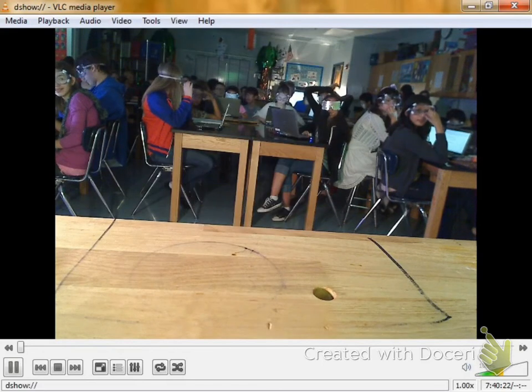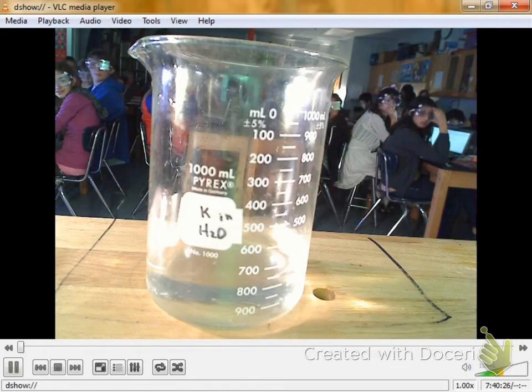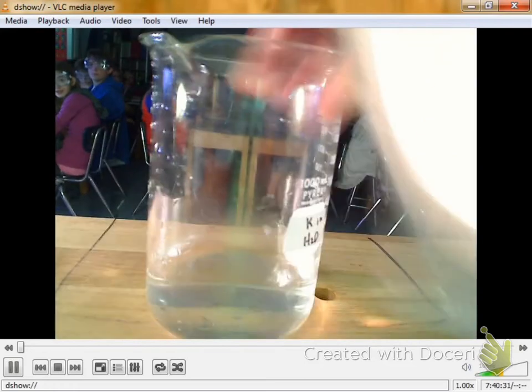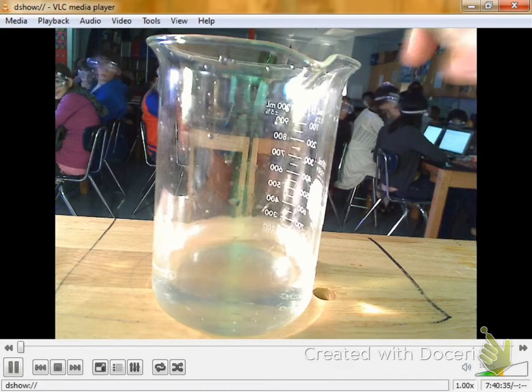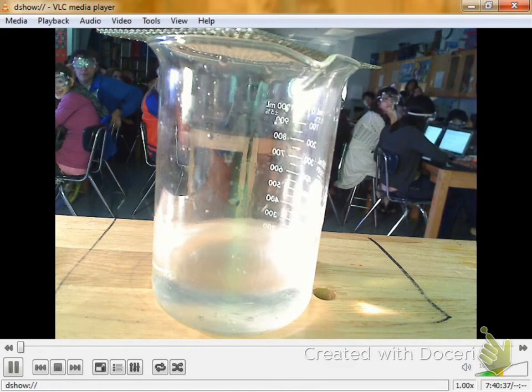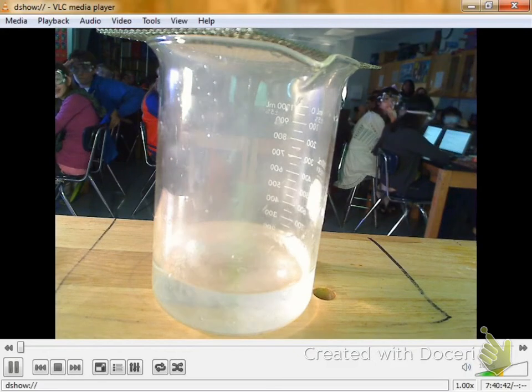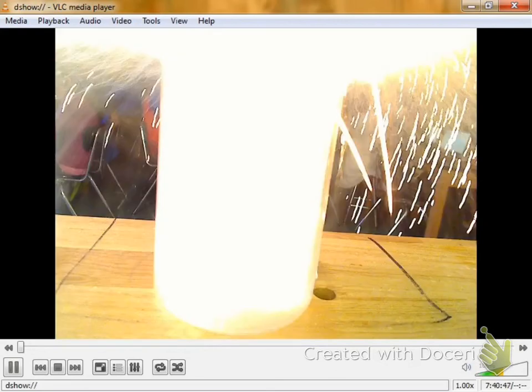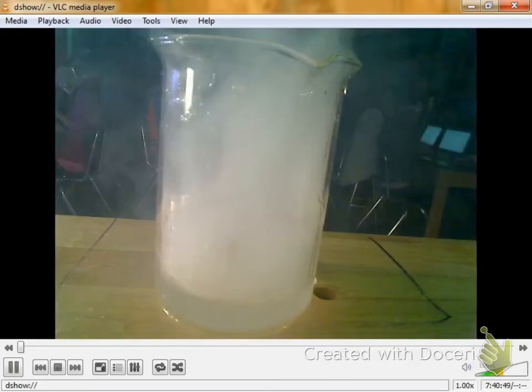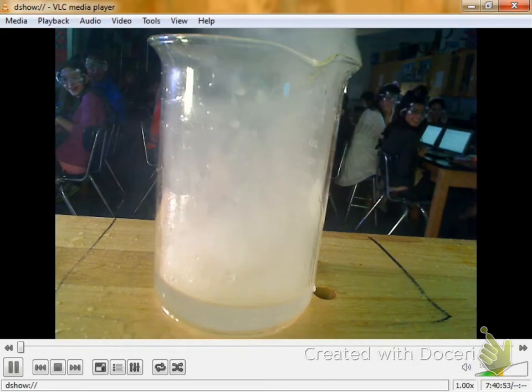Alright, bonus. Let's try it one more time. Is that red? Alright. Not putting any cabbage juice in this time. I'm just leaving it white. Did it turn red? Gotta be safe in the lab. Fireball! Oh boy. Whoa. Fire in the hole. Is this a different metal? I got fire that time.